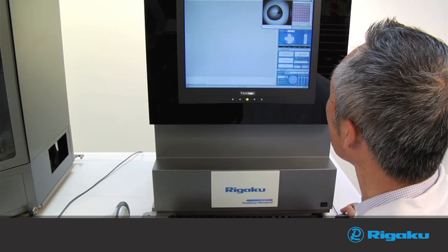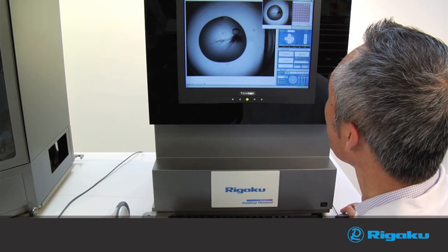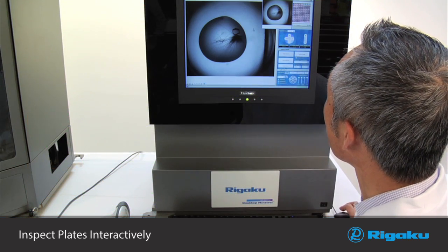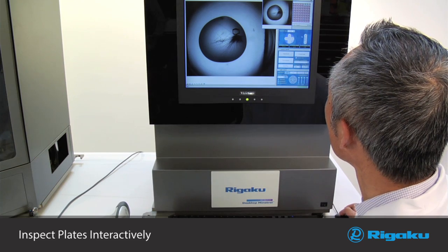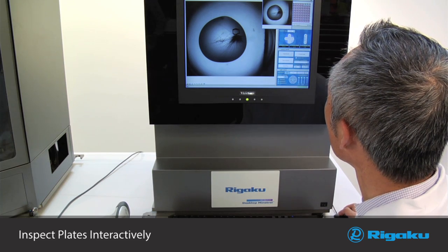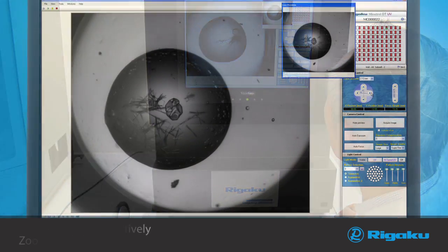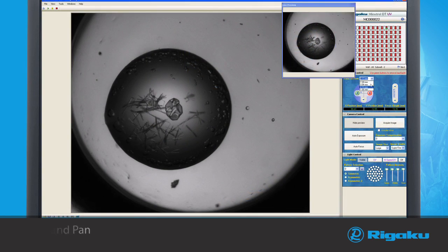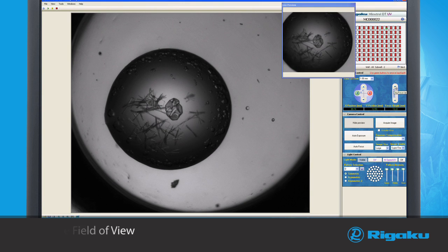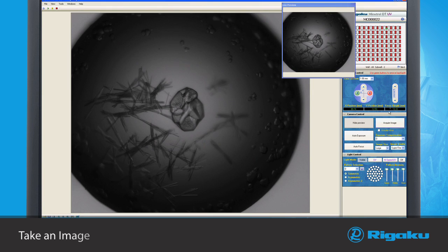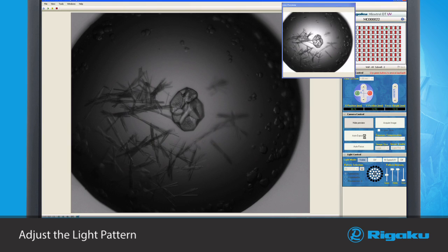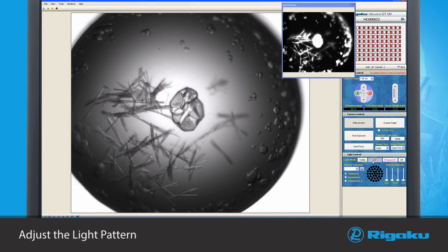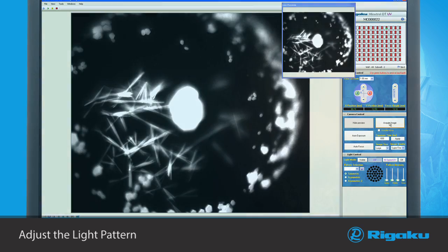The Minstrel DT UV can also inspect plates interactively, similar to a conventional light microscope. You can zoom and pan, adjust the field of view, adjust focus height, and take an image. You can then adjust the light pattern using a variety of available light patterns.